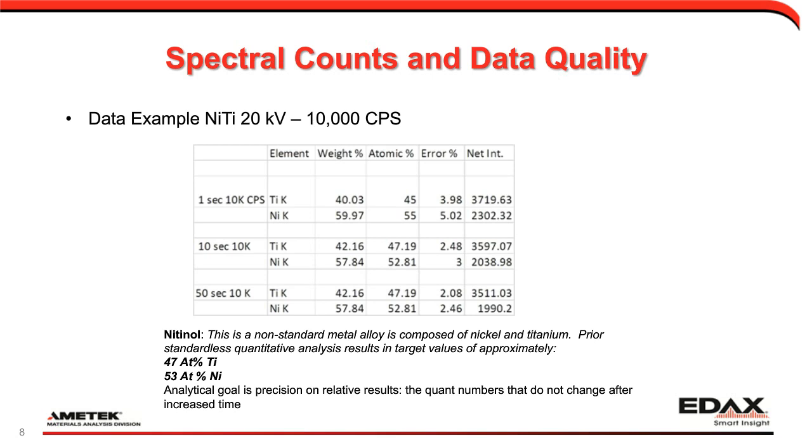As Jens showed us, with the new electronics, we can process more counts quickly. So faster amp times mean more X-ray counts per second. And that means more X-ray counts per second throughput, making its way into your spectral data. And within your spectral data, that pays off in terms of allowing the quantitative routines, the software, to best do its thing and turn it into quality concentration values. So the first example is a nitinol sample.